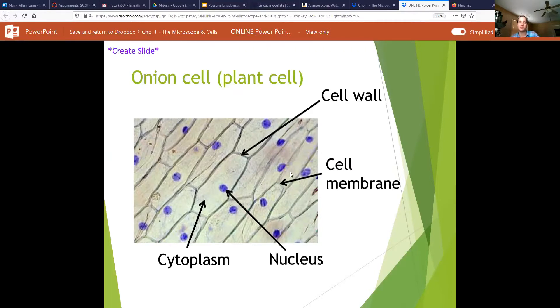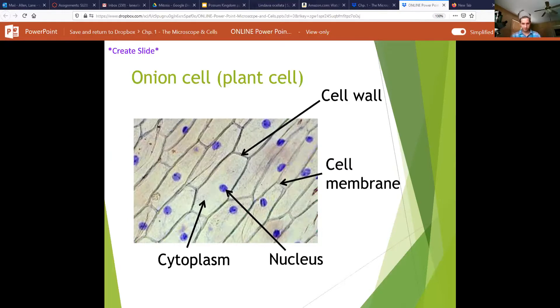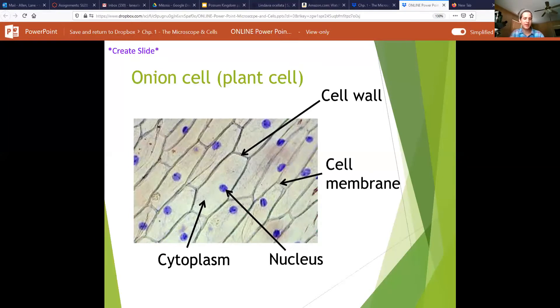You will also have a cell membrane on the inside of your cell wall. That is because all organisms have a cell membrane. Put an extra emphasis on that, because if you're taking notes, maybe you should write that down. That's an important fact.